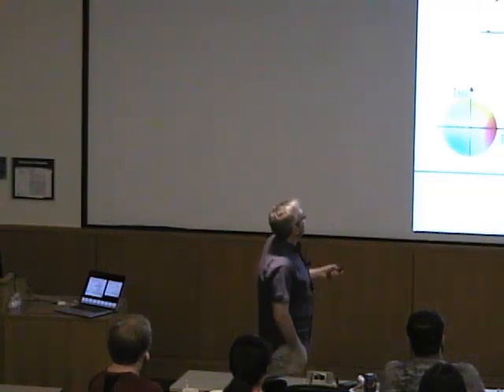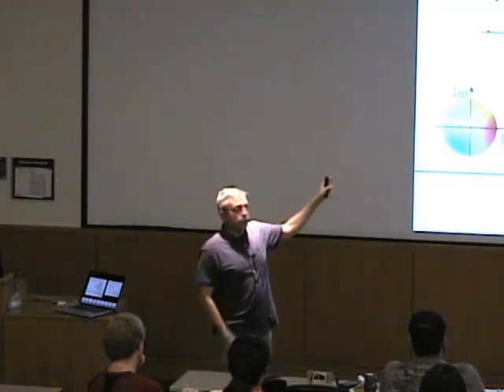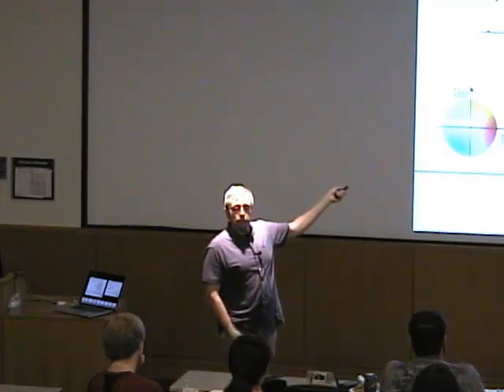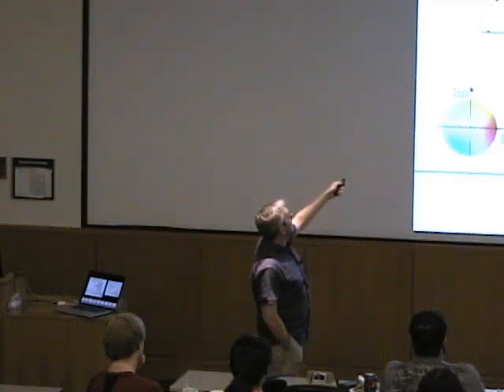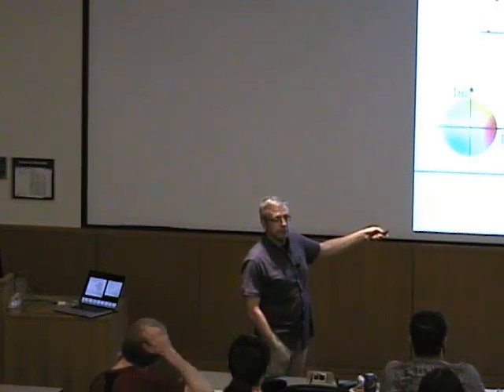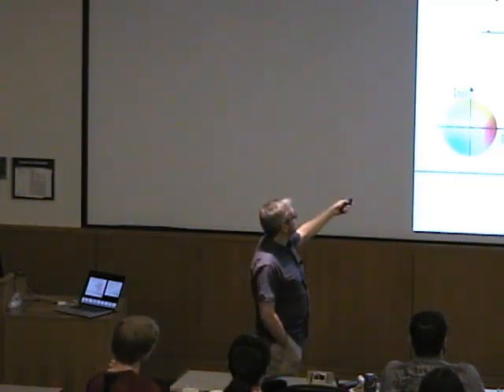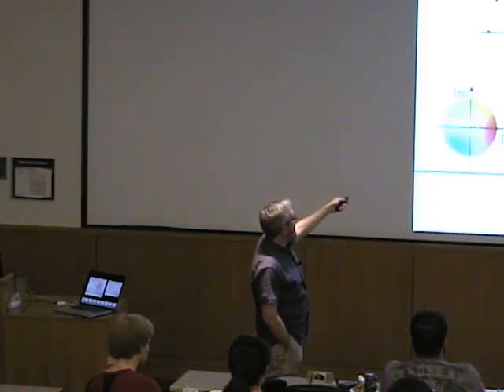Okay, if you take this, and these are real Fourier transforms of these graphic files. Okay, that's really how this looks technically if you do this. If this is our crystal lattice, then this is our reciprocal lattice. Okay, I took focused points now, point atoms, in order not to wash this out so that it's better visible.